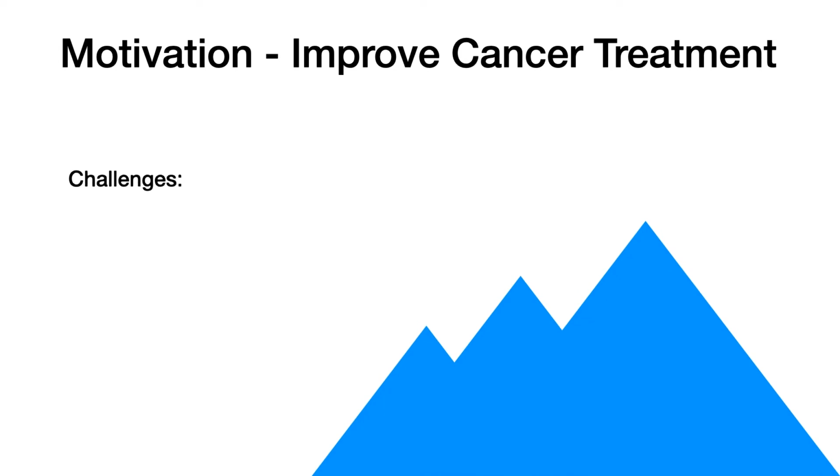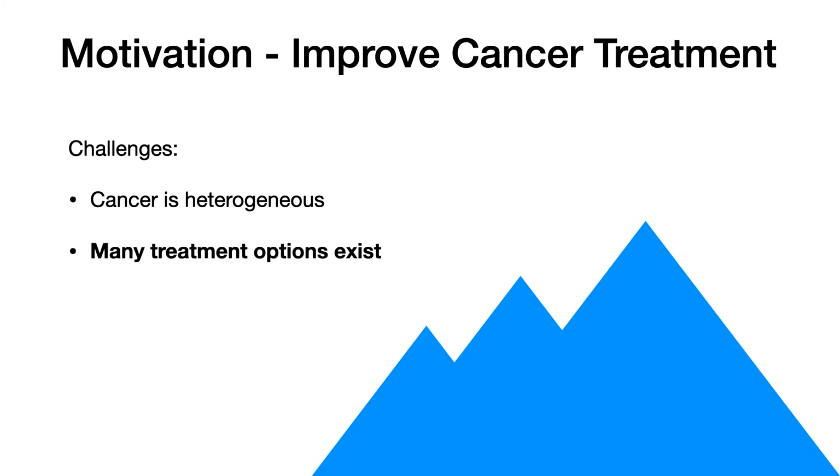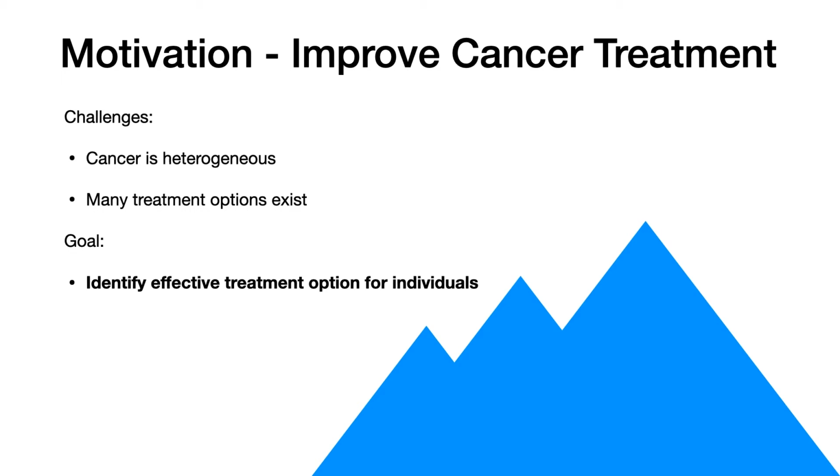Unfortunately, cancer is highly heterogeneous, meaning that different kinds of cancer behave quite differently. To combat this, many different drugs have been developed. However, it is difficult to know which drugs will be effective for a particular patient. Our collaborators use a quantitative phase microscope to measure the growth of cancer cells that have been treated with different drugs in order to find an answer to this question.